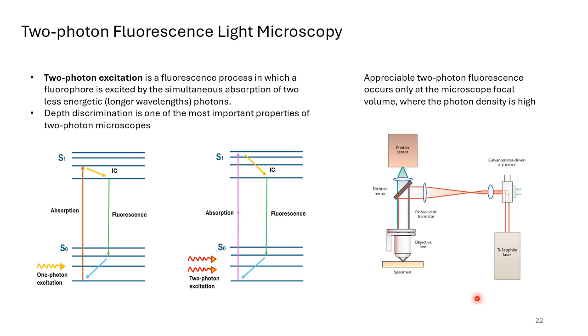Again, as the probing light is of longer wavelength, less scattering occurs than with shorter wavelength light, and it allows one to explore samples at a deeper penetration depth. And also, as it has a longer wavelength, it has a higher Stokes shift, and due to this, it is easy to separate in comparison to any regular fluorescence microscopy.